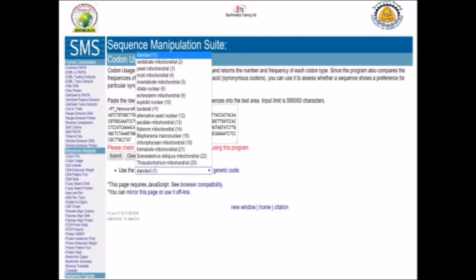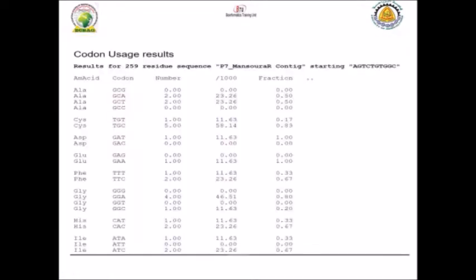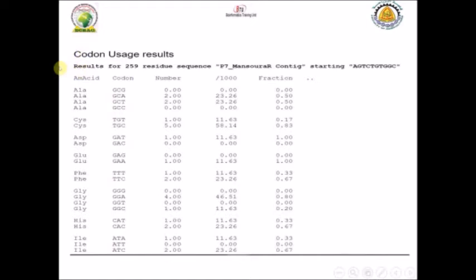You will get your result immediately. The result consists of five columns. The first column gives you the name of the amino acid, for example alanine. Because alanine has four different codons, you can see alanine has GCG and the other codons.